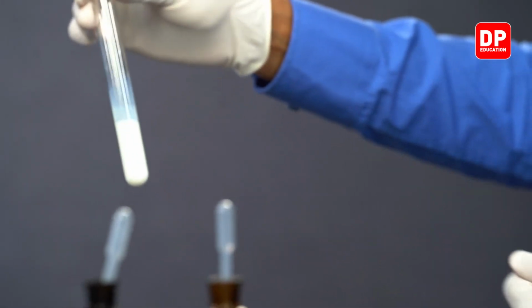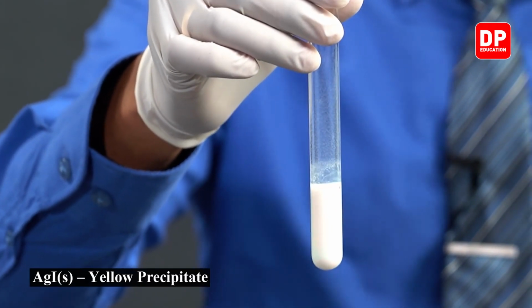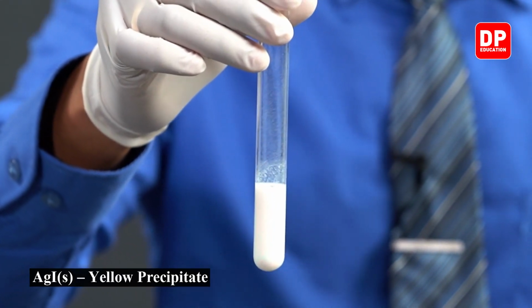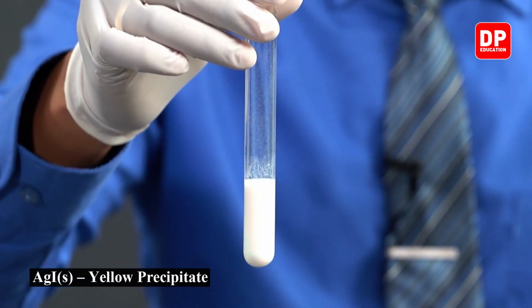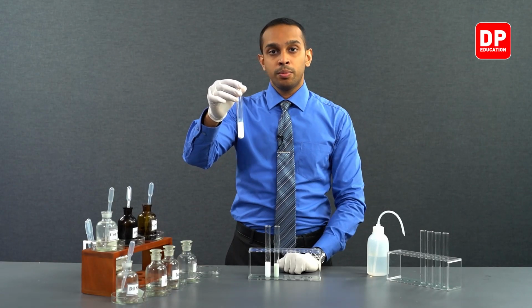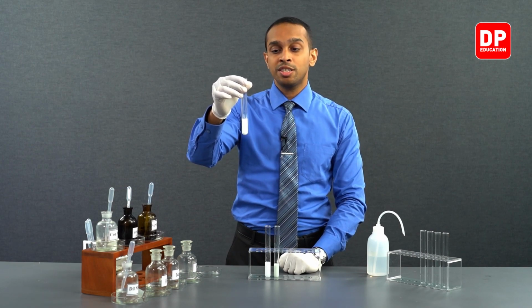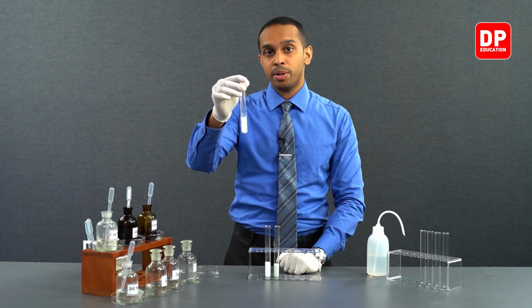This is referred to as a yellow color precipitate of silver iodide. As a result of reacting potassium iodide with silver nitrate, we obtained silver iodide precipitate, which is described as a yellow color precipitate.